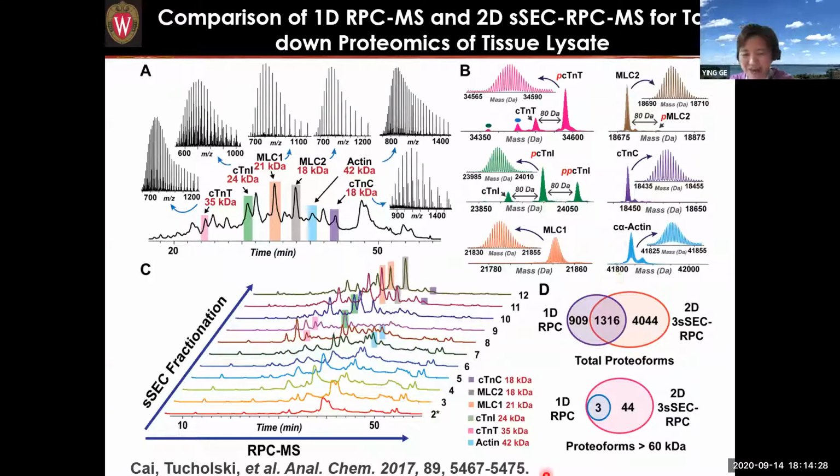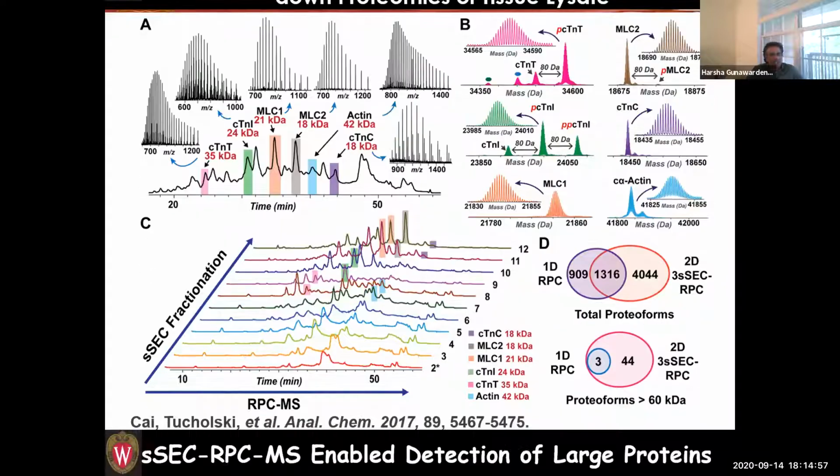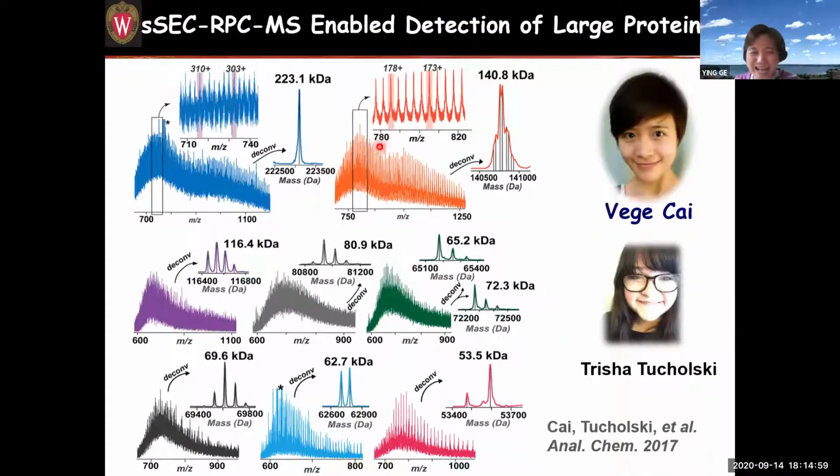I come back to Harsha. The deconvolution software, MaxEnt, is really good deconvolution software, but they probably won't allow us to incorporate it in the mesh because then they cannot sell the software, right? I wouldn't say MaxEnt is the best, because sometimes you get a lot of deconvolution artifacts as well as artificial peak sharpening, and that could be really problematic in a pharmaceutical setting where you have to rank order based on modification levels.